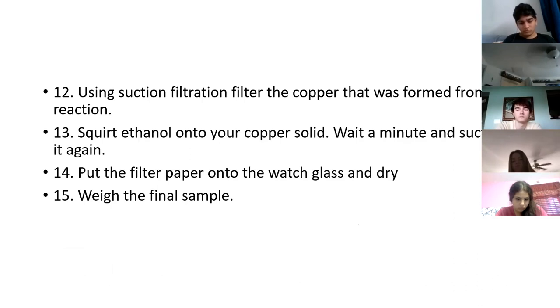I squirt ethanol onto the copper. Anybody know why I'm going to squirt ethanol onto the copper? Has anybody ever put isopropanol on their skin? Yes. What's it feel like? Cold. The reason it feels cold is that the isopropanol is grabbing water that's on your skin and it's evaporating off. The evaporation process is endothermic.